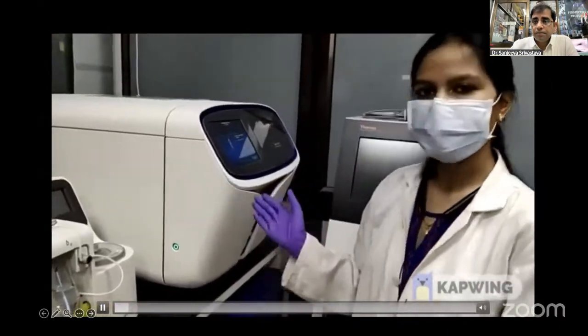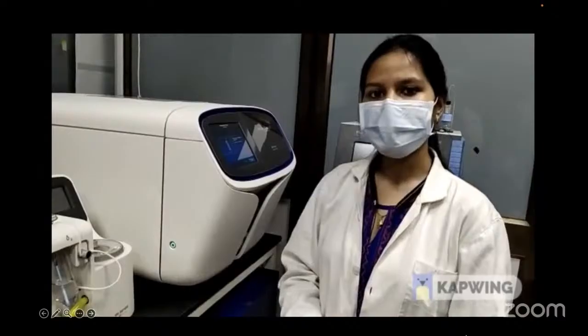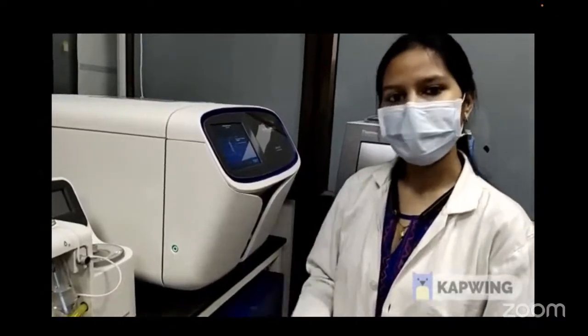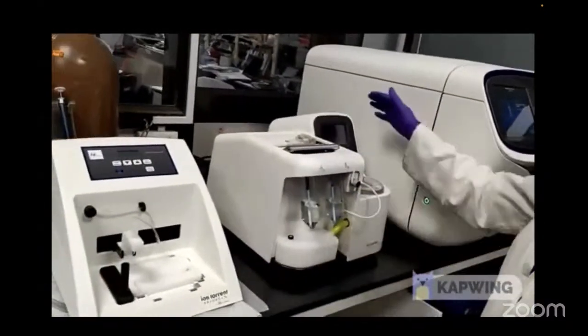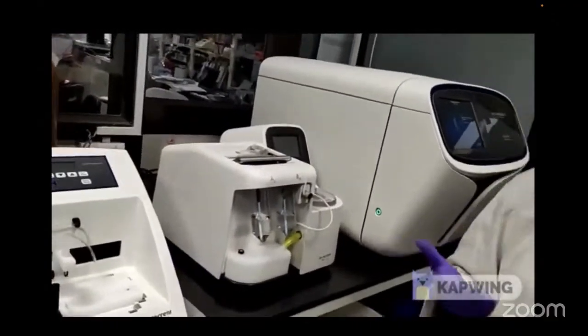In the meantime, let's quickly flash through the genomics before we move on to the proteogenomic data analysis. The instrument behind me is the Ion Torrent S5. This instrument detects the proton ions released during the formation of phosphodiester bonds as a signal for sequencing. It comes with 2 other smaller instruments, which are the Ion OneTouch 2 and the Ion Enrichment System.